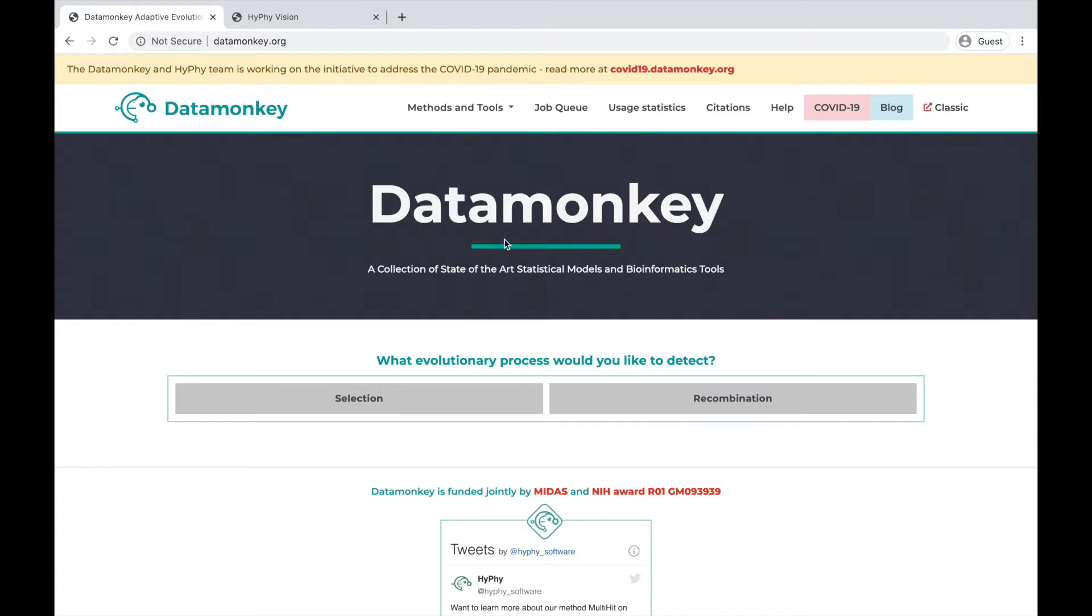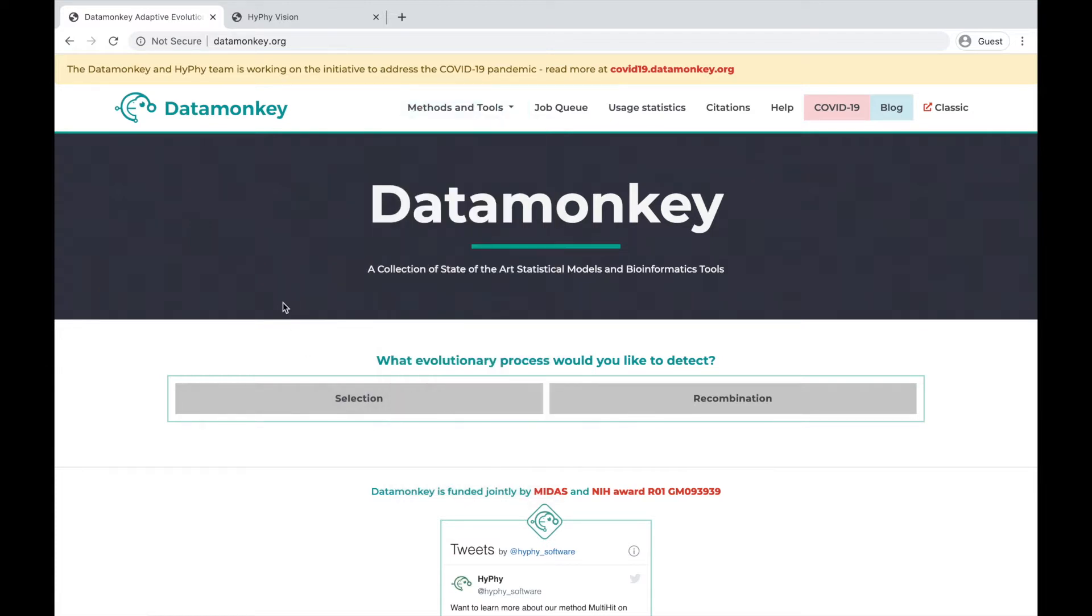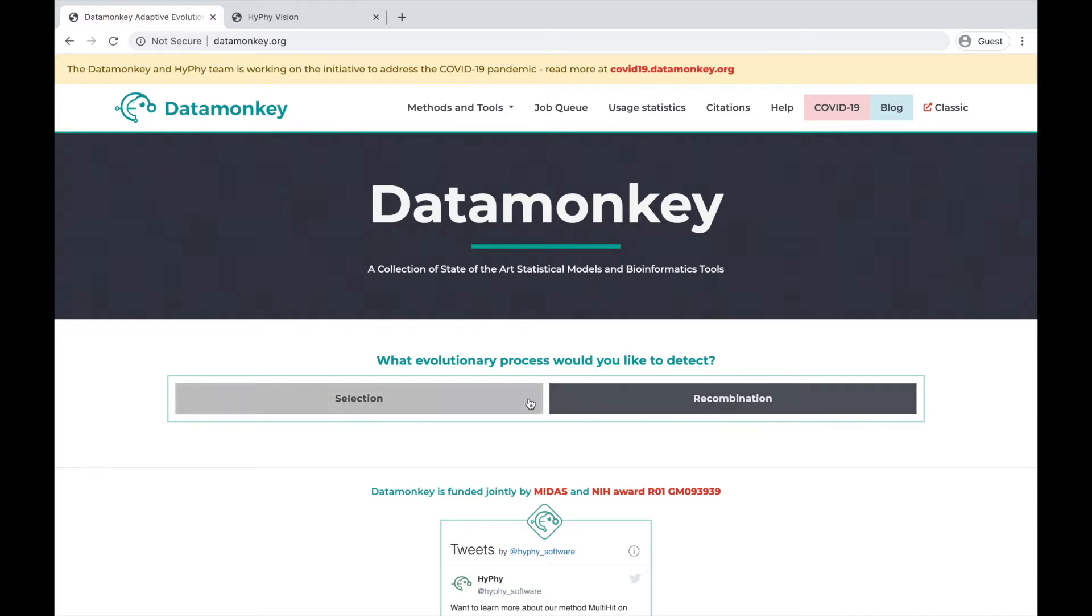If you know what tool you want to use, just click the methods and tools drop-down and select it from the list. If you're unsure but know what kind of evolutionary process you'd like to detect, you can click through these choices to find our recommendations.